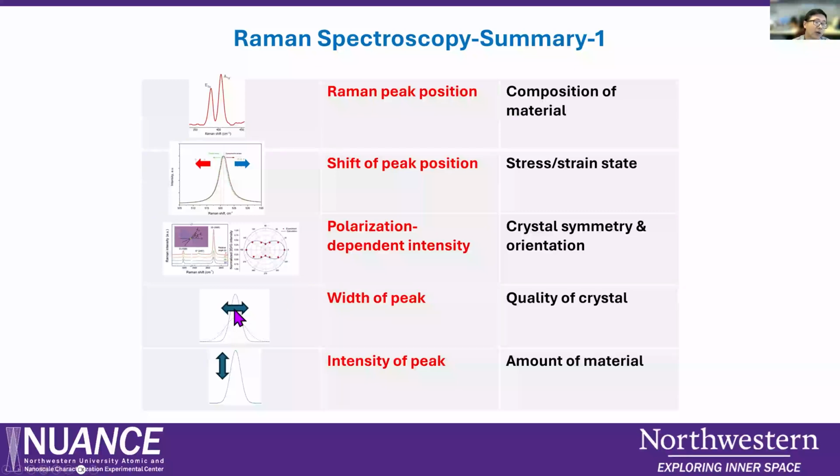And if you see the Raman peak width change, this gives you the quality of the crystal. If amorphous, the peak is broad; if highly crystalline, it is narrow. The intensity gives you the amount of material. Of course, with more material, the intensity will be higher. And if you increase the power of the laser, the intensity will also increase.